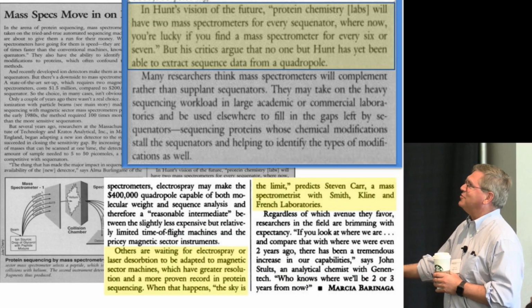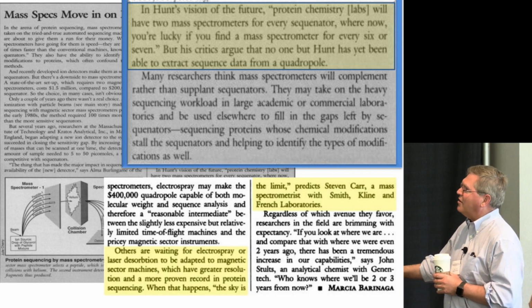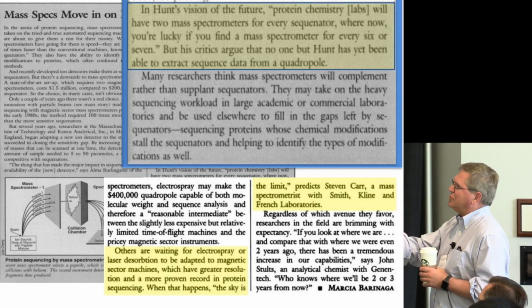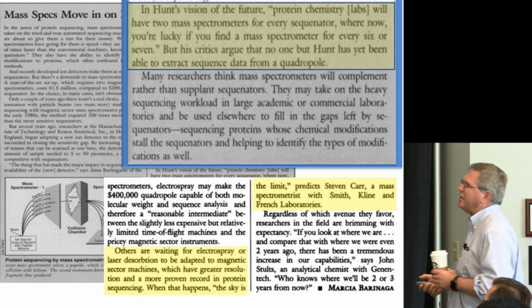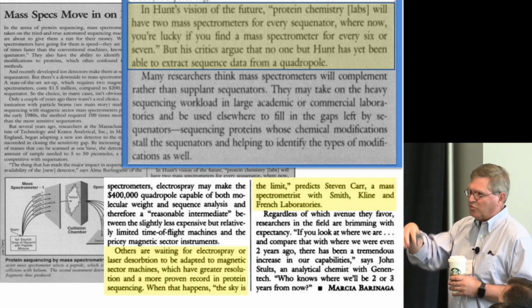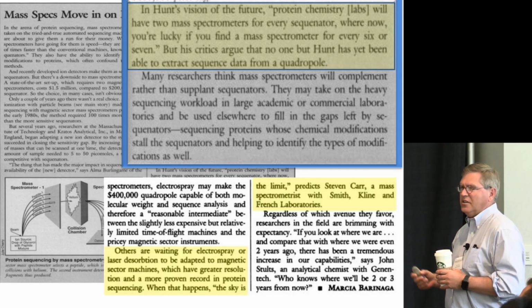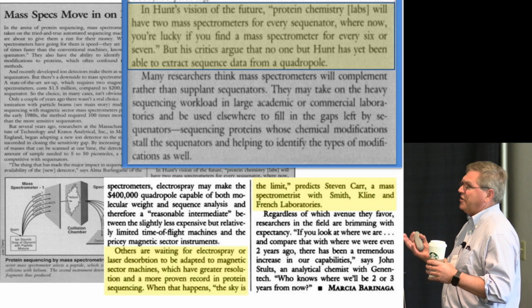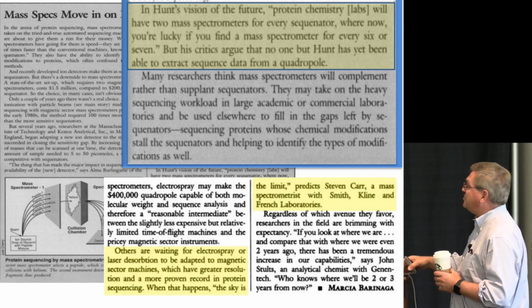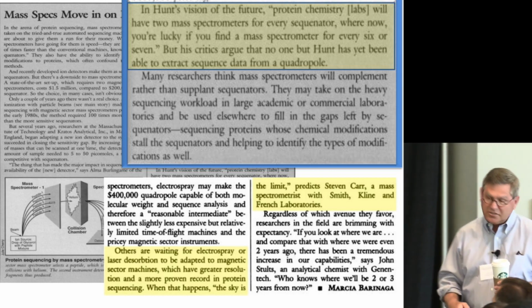So magnetic sectors were the Orbitrap of the day. High resolution, high mass accuracy instruments, they were the workhorse of organic chemistry. And the problem was they were very slow to scan, so you couldn't do electrospray on them easily. You couldn't adapt the electrospray source onto a magnetic sector because the source in a magnetic sector instrument floats at 10,000 volts. And then they scanned so slowly that you just couldn't do LC. And so it was like the asteroid hitting the planet and the dinosaurs disappearing. Magnetic sectors were gone. They're now still used a little bit in environmental analysis. They're really good for doing dioxin analysis.